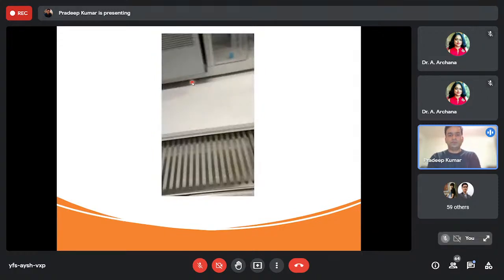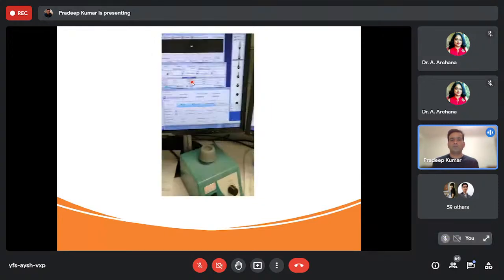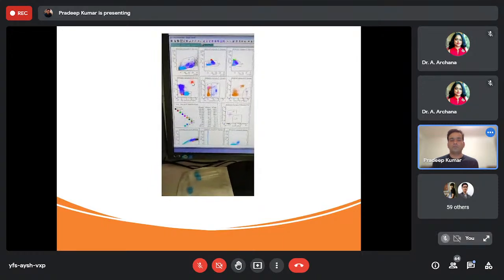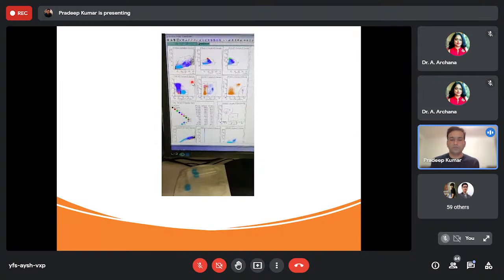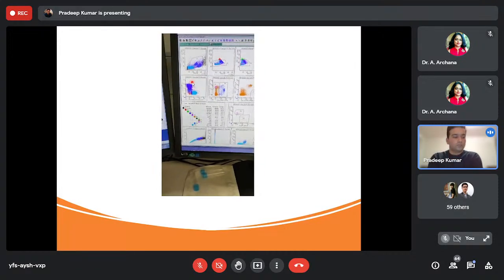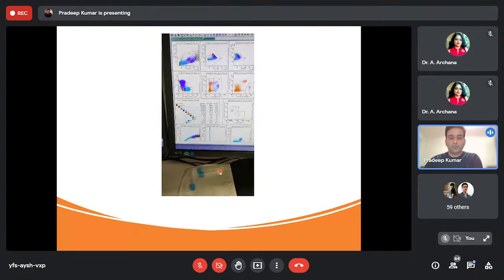Okay, so the moment interrogation happens, after the fluidics, your optics is divided into 2 parts. The first is to generate the signal. Generating the signal means the scattering of light, and that includes lasers, the source of light that we use in flow cytometers. Those signals are then sent to the second component of the optics, which is called collection optics, where you collect the signals. Signals means photons of different wavelengths coming from the fluorophore. These fluorophores absorb wavelengths and then emit wavelengths.